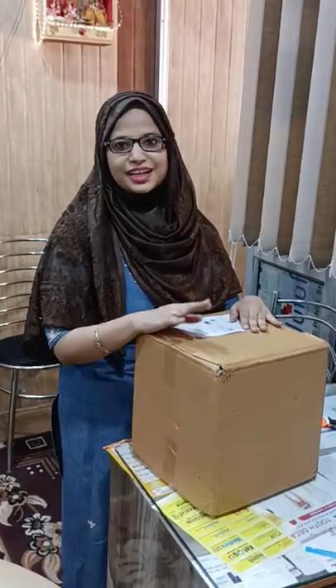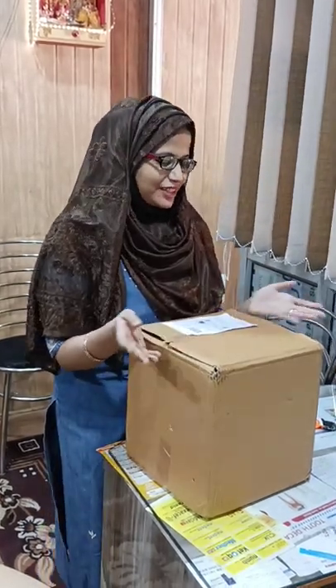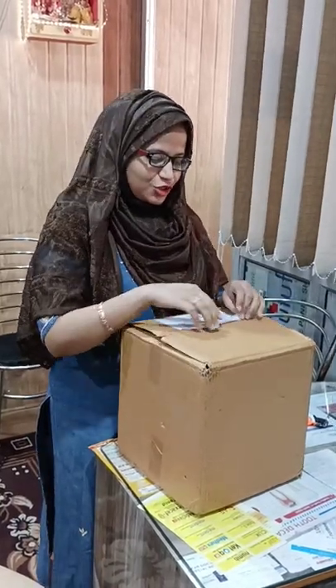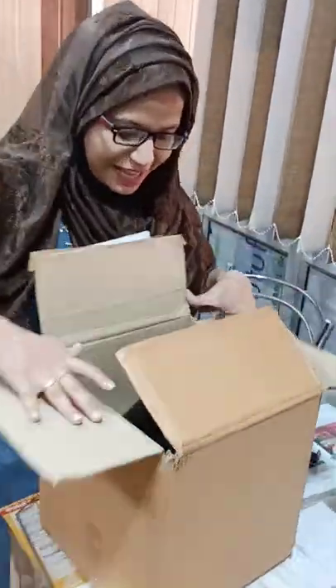Hey guys, this is a fake unboxing video because in the hurry of checking for the quality of the product at the time of delivery, I forgot to shoot the video. So I am pretending to unbox this product right now for the first time. We'll just open this — it's already open — and here is the product.